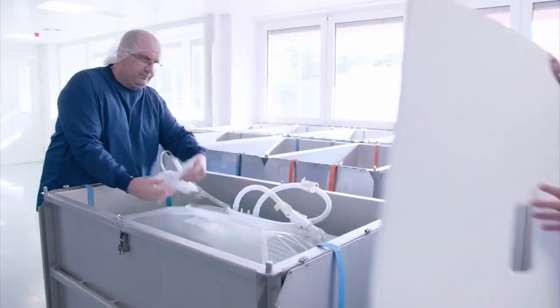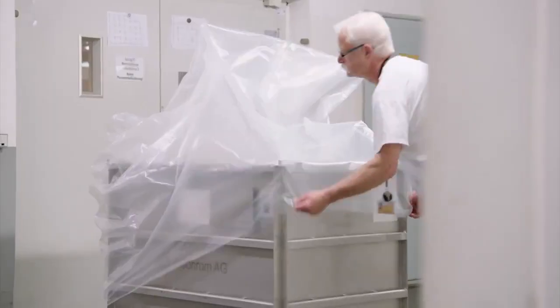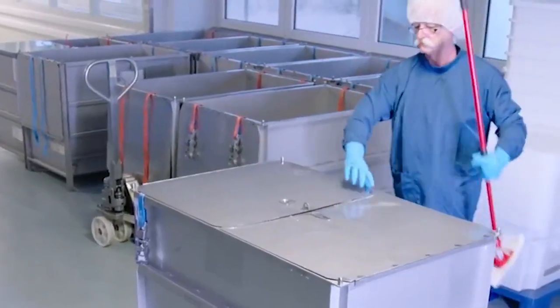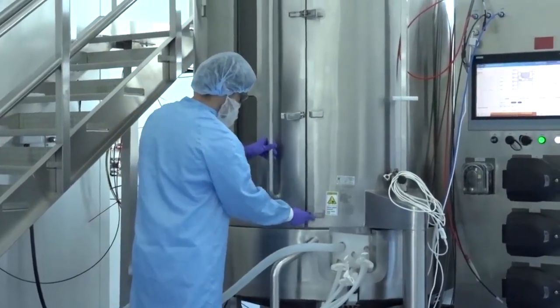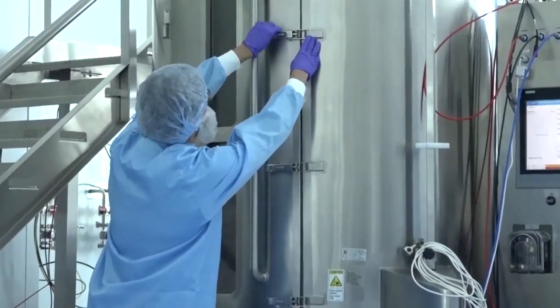In addition to cell culture materials, other gateways through which adventitious viruses can enter the process include buffers, product packaging, improper cleaning, and of course, human operators. Approaches to preventing virus contamination include stringent cleaning procedures, high-quality clean-in-place chemicals, and implementation of single-use bioreactors to reduce the risk of carryover contamination between batches.